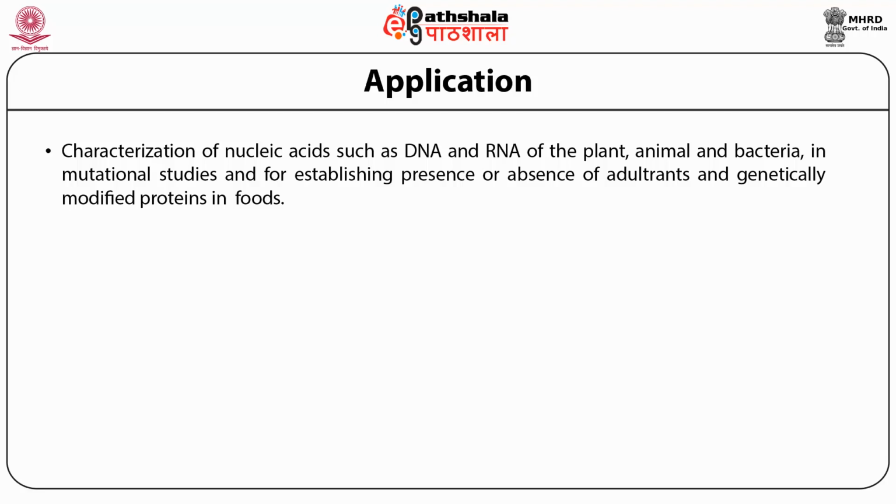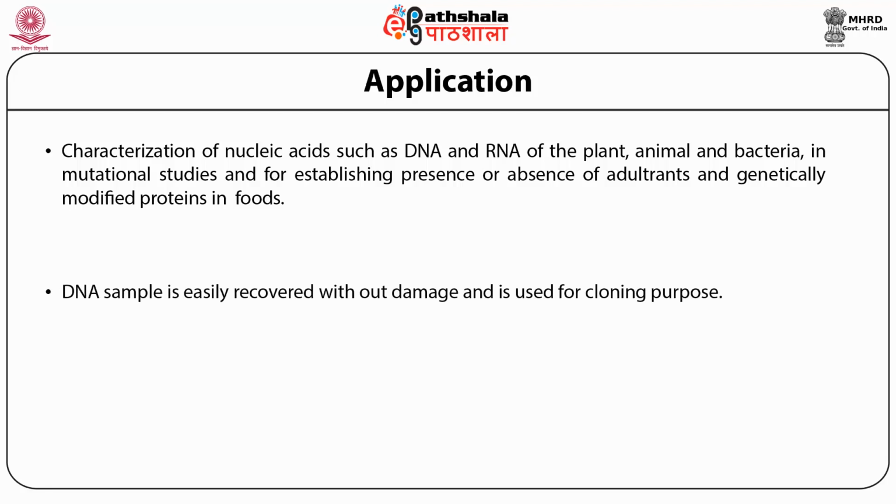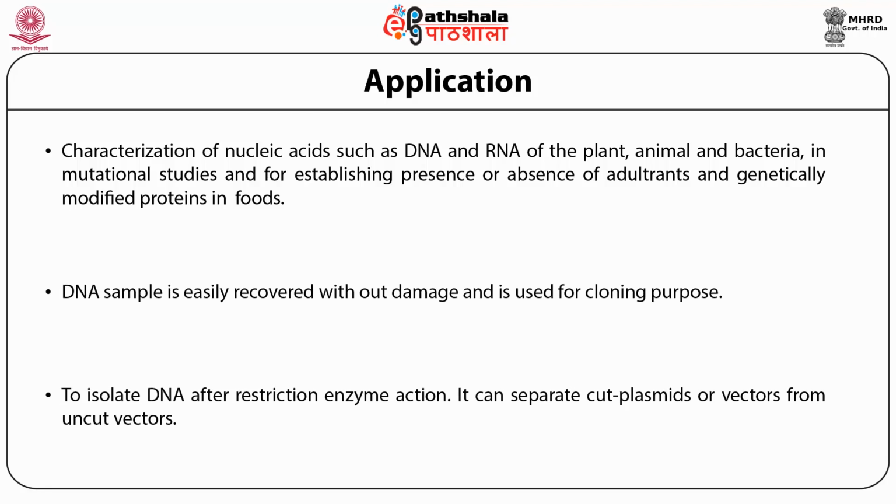Name any application in molecular biology, we find that this particular technique is very well linked with molecular biology work. With this, we will say this is a very highly specialized technique, but of course, the technique can be performed by a technical person only. This, we say, could be a limitation. This is not a simple technique which any person with a moderate knowledge of science can do. It has to be performed by specialized technical hands for its success.